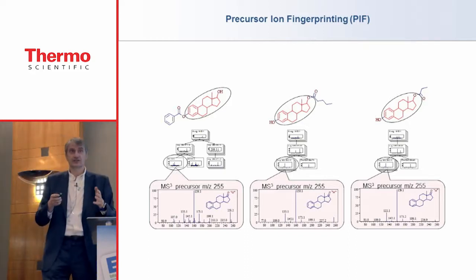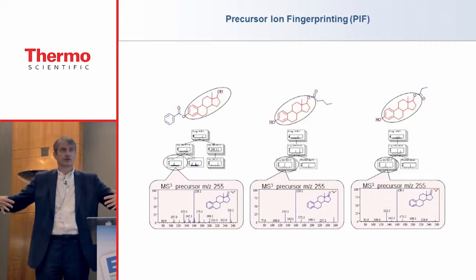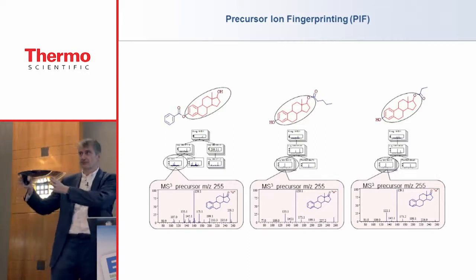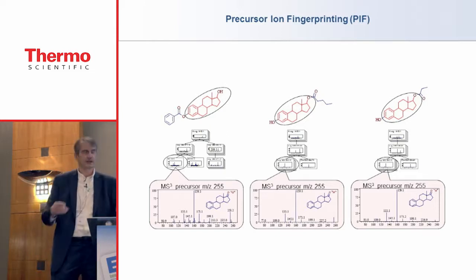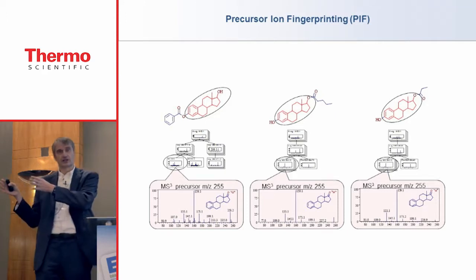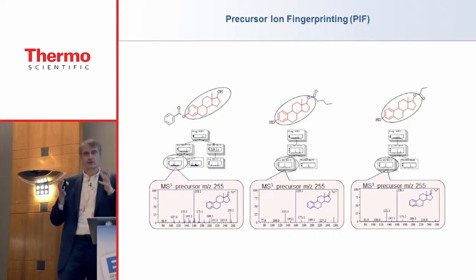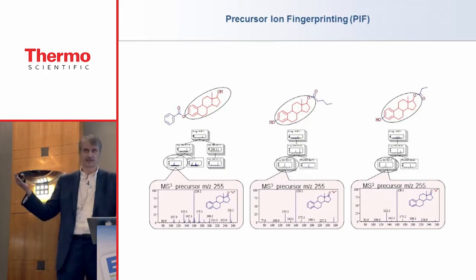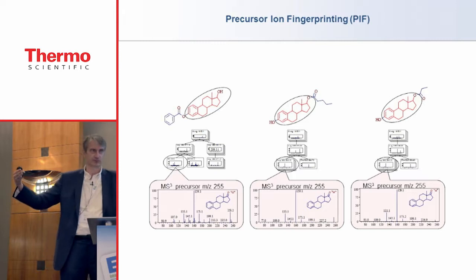And this is the reason why we build very rich spectral trees, because we would like to build a database of substructures. If we cannot identify the structure itself, at least we can identify substructures. The advantage of this method compared to other computational techniques you are reading about in scientific papers is that we are not doing some strange mathematics here. We are actually comparing nature against nature. So we are comparing the spectrum of a substructure against the spectrum of a substructure.